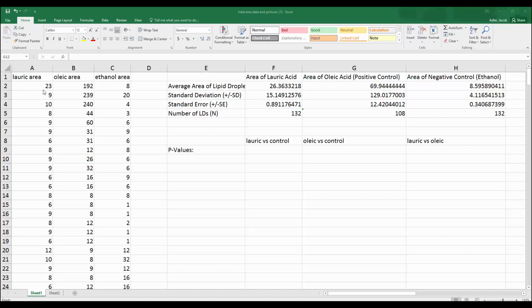So that you know what you're doing, because I've seen a lot of students in the past where they won't label something correctly, or they'll have two or three different people working on it, and they all decide to label things differently or not label, and then data's been mixed up, and then they're a whole week behind because they have to redo all their data. So make sure you're labeling things well.